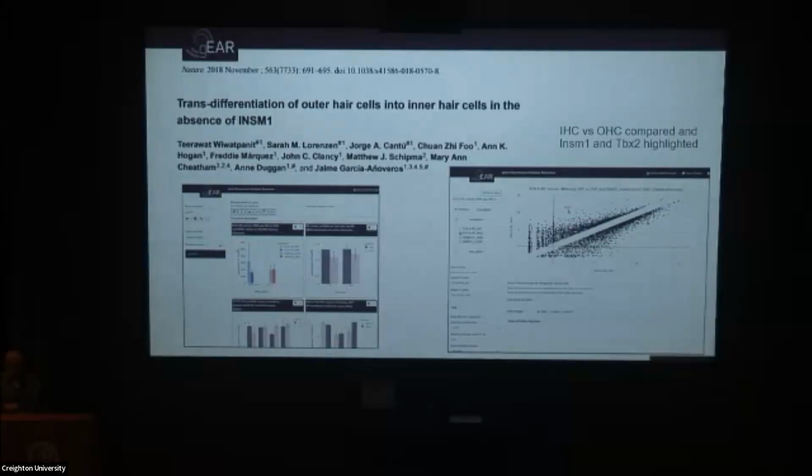So it's a very quick way to get access to that data. If you go to where your data set is, I'll show this in a little more detail, if you click the upper menu, you can access all the analysis tools for that data set. One of them is compare gene expression, and that takes you to here. You just pick the X condition, in this case I did, and the Y, and then hit plot. It shows you the whole scatter and it's interactive.